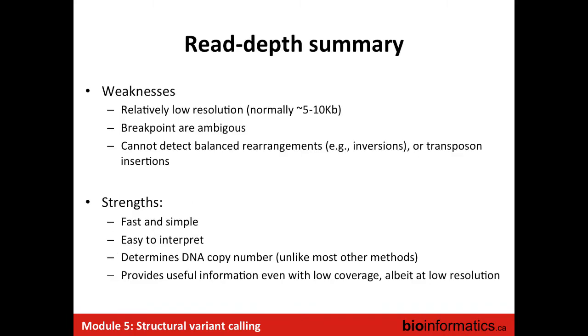So, the summary of the read depth approach. It's a relatively low resolution. The breakpoints are ambiguous because your breakpoint will fall in a bin, so you know that your breakpoint will be approximately in that range of bins. Depending on the size of the bin, if you have a 1 KB bin, you know that your breakpoint is in a 1 KB region. So it's not easy to detect exactly the breakpoint, and you cannot detect balanced rearrangements.